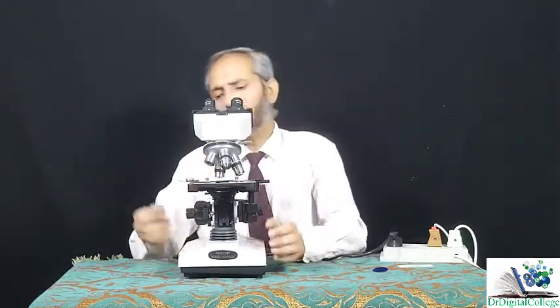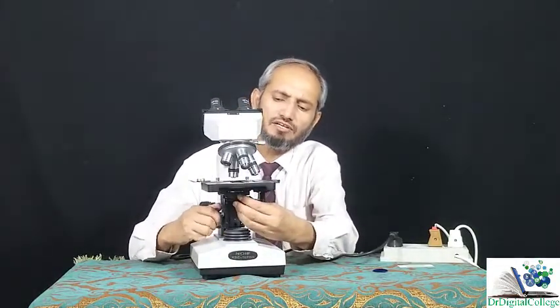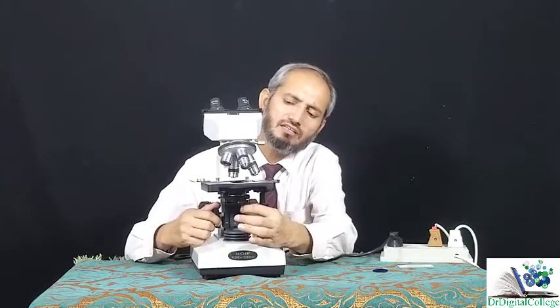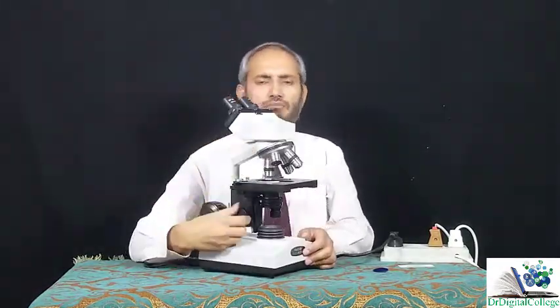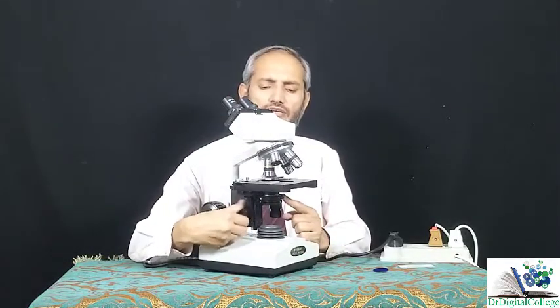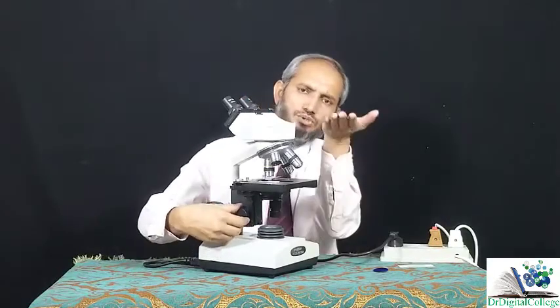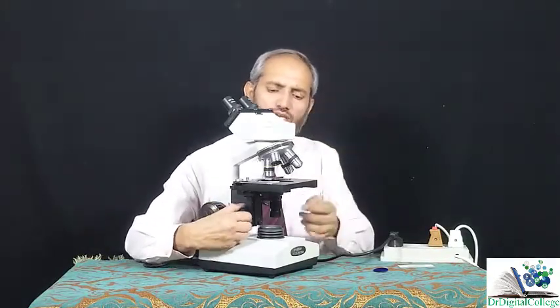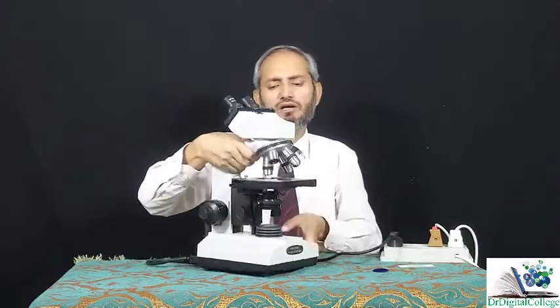One thing more is you can change the position of your light filter. This is your light filter. You can see that I am moving it down. This is the knob by which I can move it downward and I can move it upward like this. This can be brought just close to your object or it can be lowered like this. I am lowering it. Now, this is what you will adjust for the resolution.